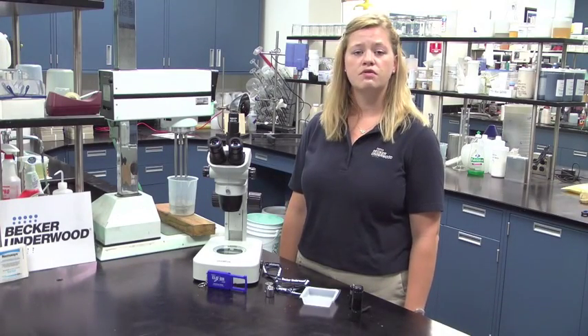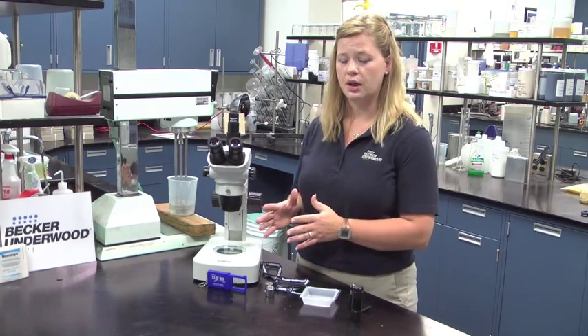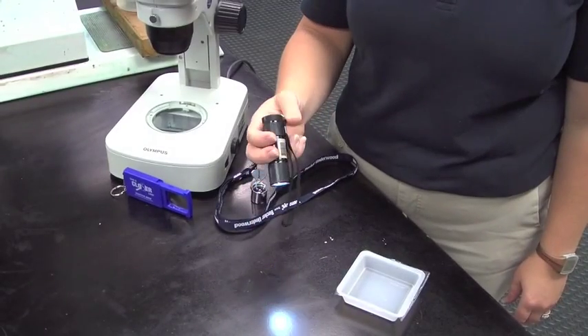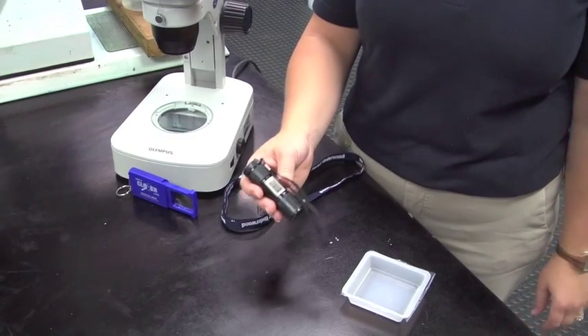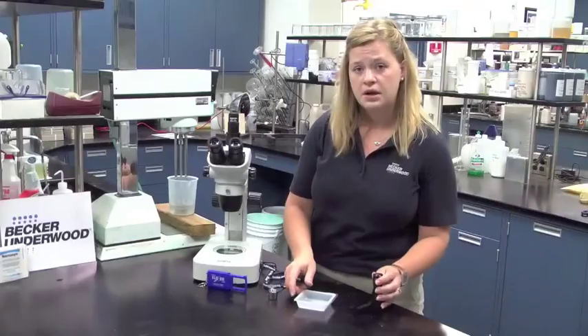Growers can check nematode viability at any time before, during, or after a nematode application. To check nematode viability you will need a small flashlight, a hand lens or a microscope, and an empty nematode tray.